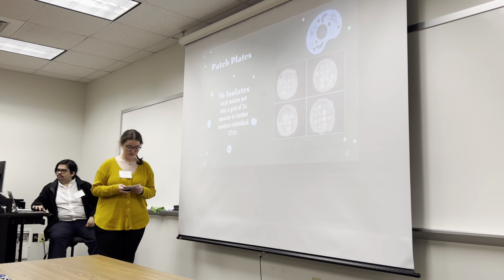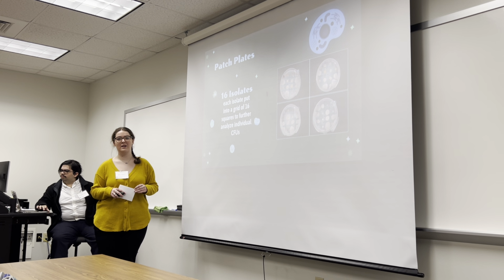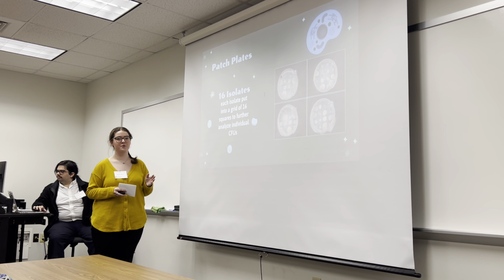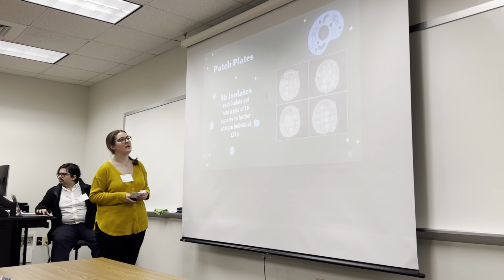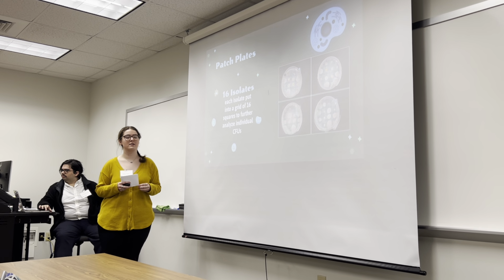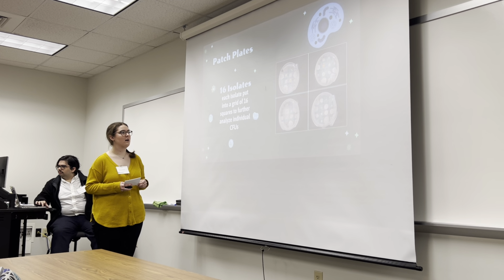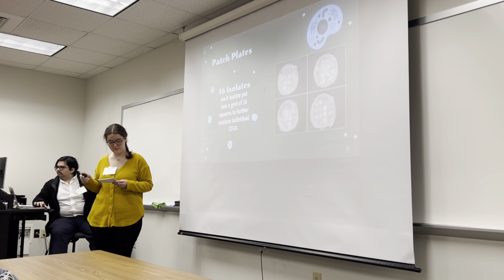So there was actually a bit of an accident with the library and patch plates. These are my patch plates. I was able to make all 4, 1 for soil sample 1 light, soil sample 2 light, and so on. And each patch plate had 16 different isolates. These were isolates that I had gotten from my library plates and had tried to get a single colony by itself. That way I could further analyze the individual CFUs.